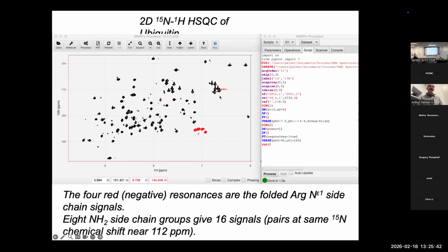So that means that these red peaks should have gotten the phase applied to them as if they were at 80 parts per million, but instead they got the phase applied for whatever this edge is, minus 20 parts per million. And it turns out when you work out the arithmetic, that'll mean that they're exactly inverted.